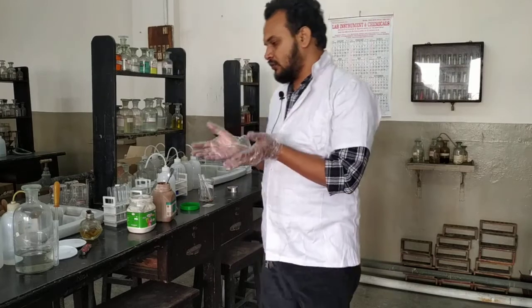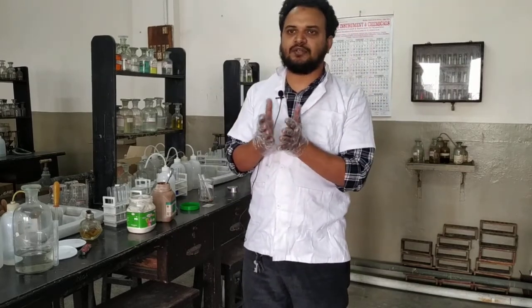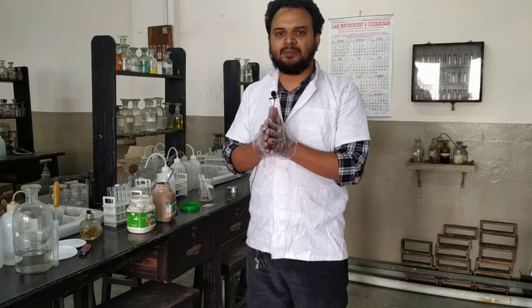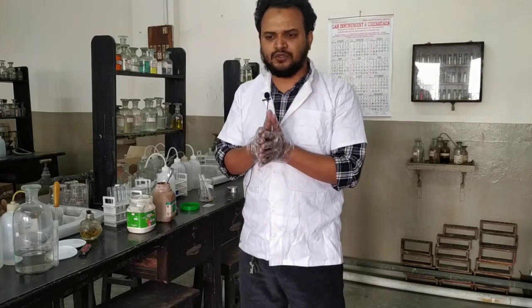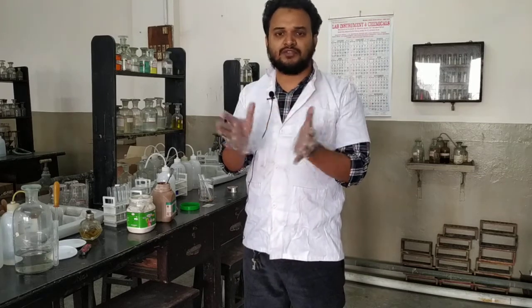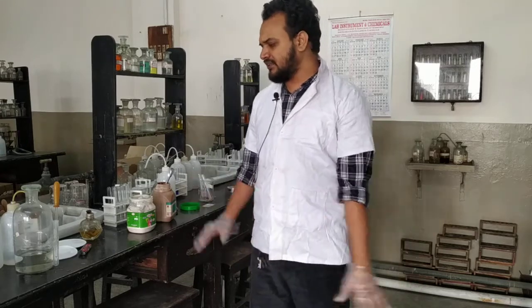So we will start with any reducing sugar. You know from biomolecules that there are two types of sugar, reducing and non-reducing. So it does not depend on whether it is ketose or aldose. Some other things are there. I am not going into that much theory. You will learn it in the theoretical part in biomolecules. So let us perform the Tollen's test.